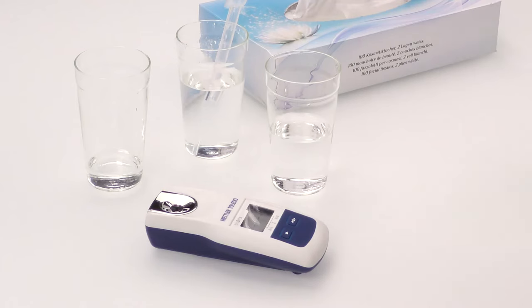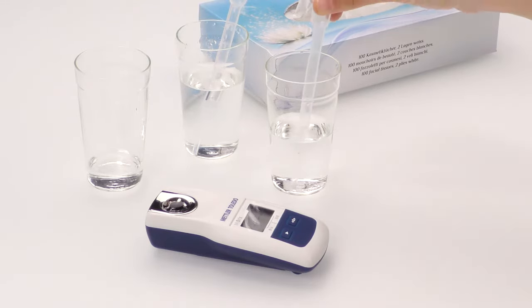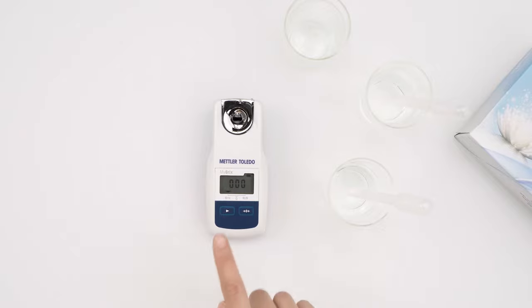Add pure water, approximately 0.3 ml. Press and hold the 0 key for 4 seconds until the display shows the 3-0 symbol and the calibration starts. When complete, the display will show the 3-0 symbol.